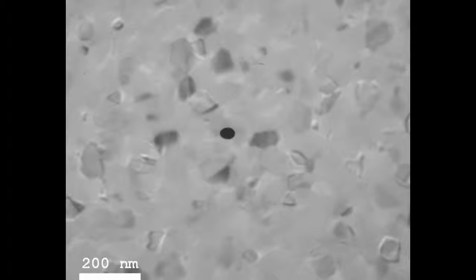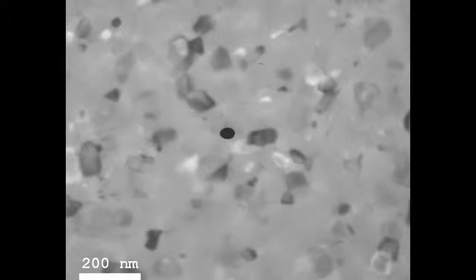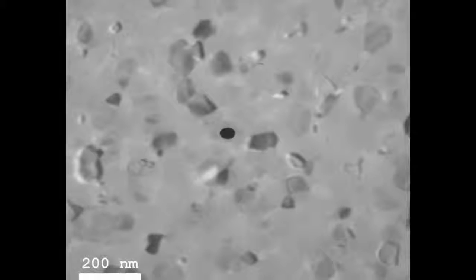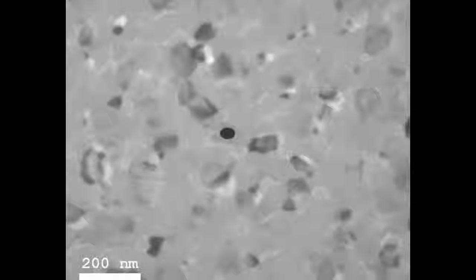And as you can see, some regions become black because fewer electrons hit that part of the screen, and white becomes whiter or brighter. That's because more electrons will hit that part of the screen. And I can change the focusing strength of this contrast. And here I turn the focusing knob. And you can see these ghost white images go out and come back to these grains.